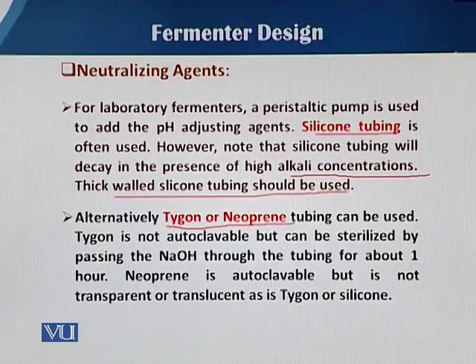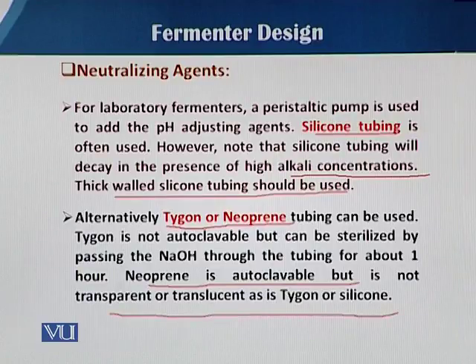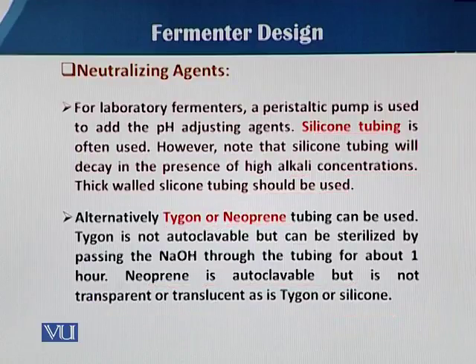Tygon is not autoclaved but can be sterilized by passing sodium hydroxide through the tubing for about 1 hour. And neoprene is autoclavable but is not transparent. So that's why Tygon or silicone tubing is mostly used for the addition of the neutralizing agent.